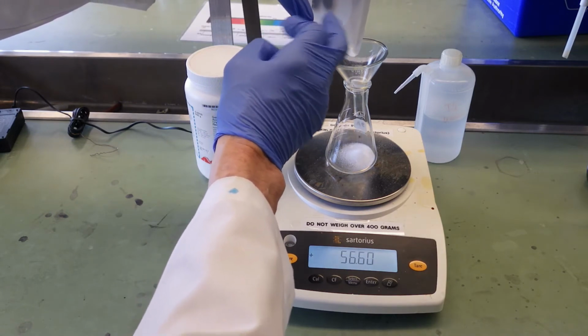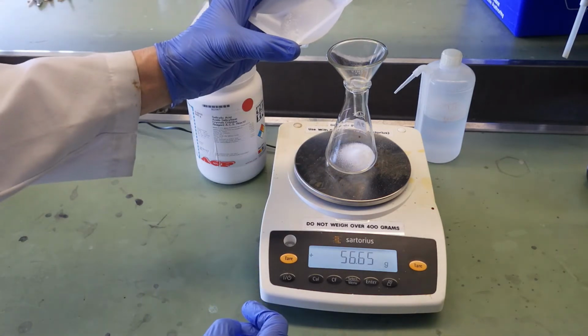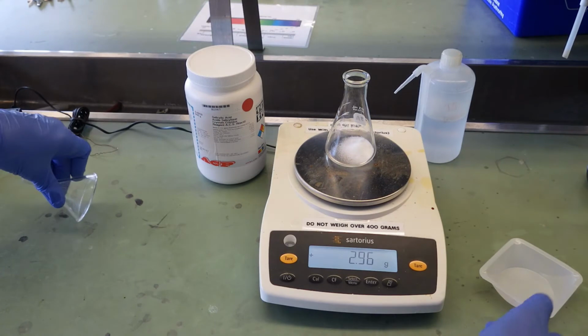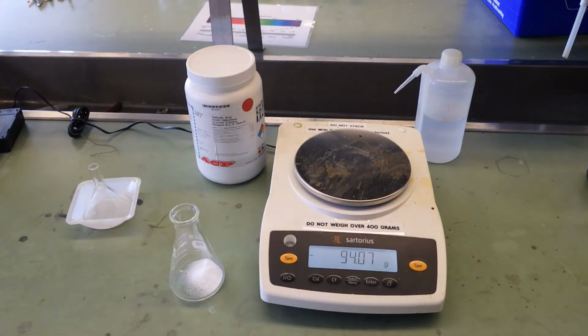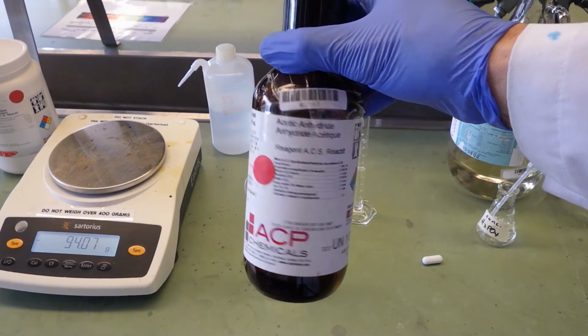You want to record this mass. 3.95 grams.